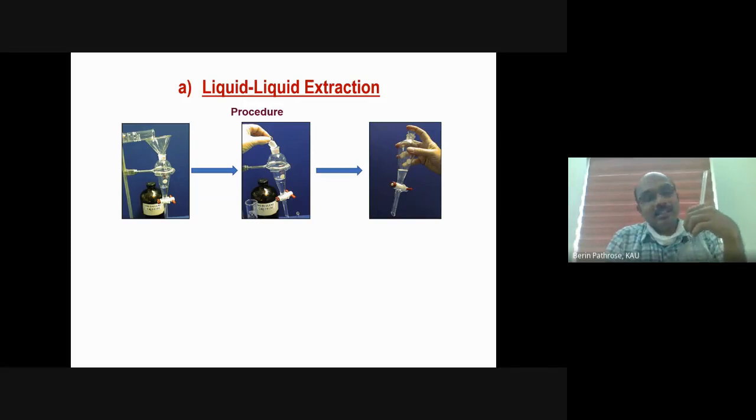You might not have heard, but even with water, once I opened the stopcock, I heard the release of air from the tip. Once solvent is there, there will be a huge release of air. If you don't do it carefully, this container can burst and it can cause damage.